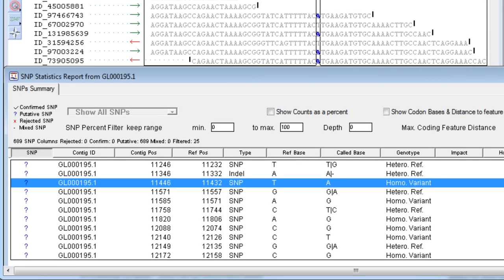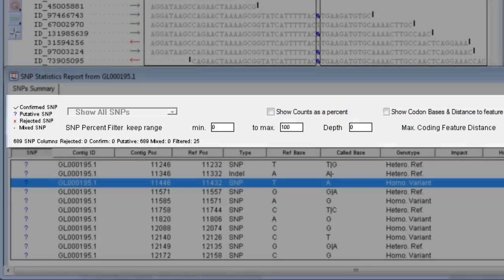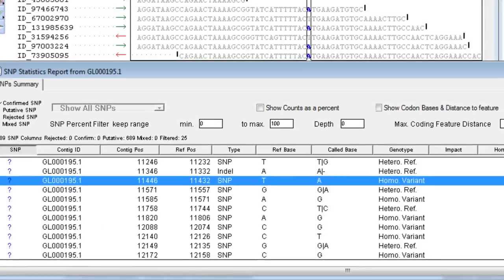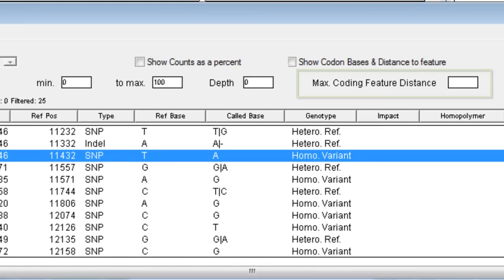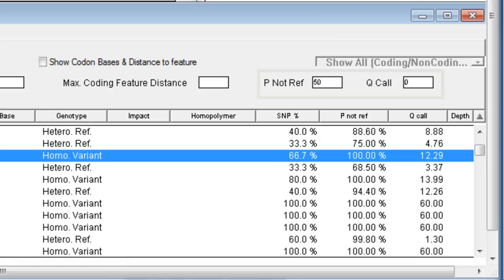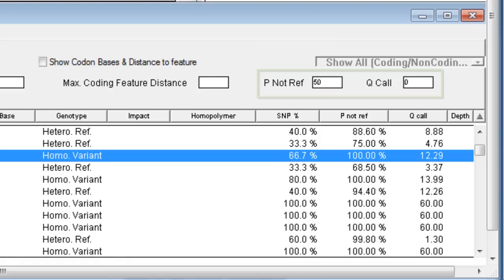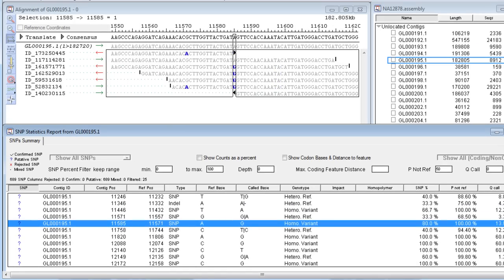Utilize the SNP report to review putative SNPs. To narrow your results, use one of the many filters available at the top of the report, such as filtering on depth of coverage, the distance from the nearest coding feature, or the statistics generated by the Bayesian statistical model used to calculate SNPs.